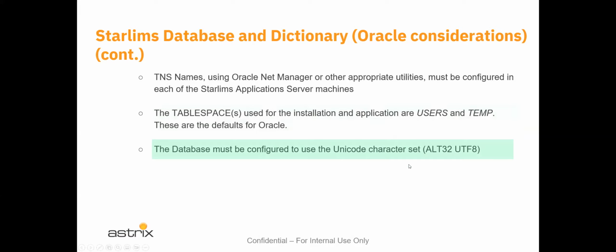And this is something I haven't really run into too much. Most servers use the UTF-8 or the Alt32 character sets. But that, again, is usually done at the database level by a DBA. If they have a situation in STARLIMS where screens start coming back on the client workstations that have weird-looking data or characters that are not part of the language that they're trying to utilize the system in, it typically has to do with the character set that's been defined on the database server, or in some instances, the application server. So UTF-8 is a standard for the Unicode character set.